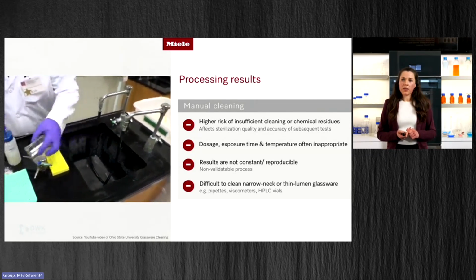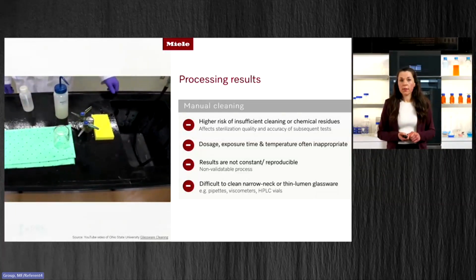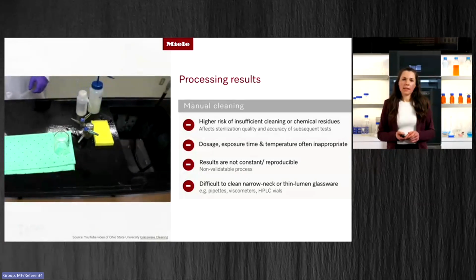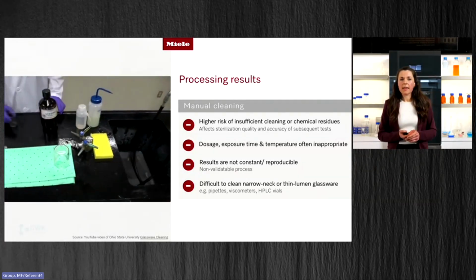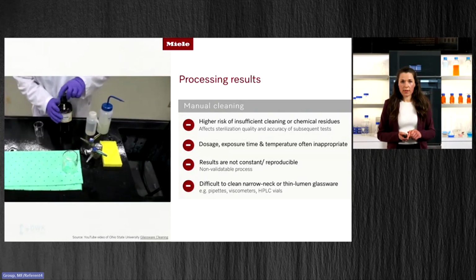And in the end, some types of glassware are just difficult to clean, like viscometers and pipettes. There's always a higher risk that in these tighter areas of the glassware, we have remaining residues.